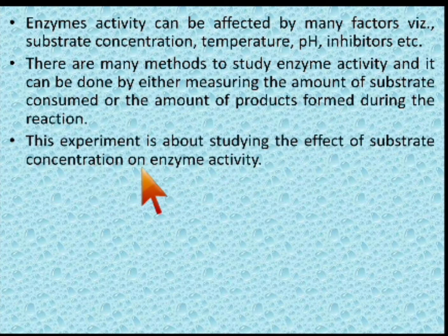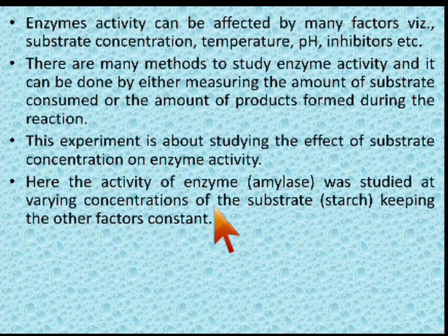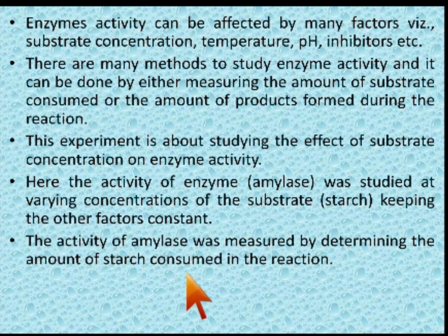This experiment, like I had said, is about studying the effect of the substrate concentration on enzyme activity. That is why here the activity of the enzyme amylase was studied at different concentrations of substrate, that is starch, keeping other factors constant. And this activity of the enzyme amylase can be measured by determining the amount of starch consumed in the reaction.